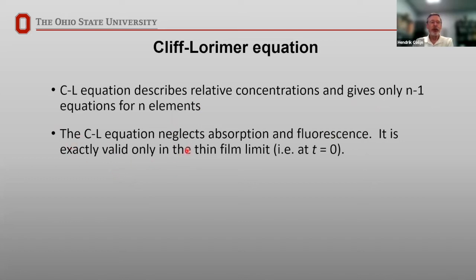So you always have 100% of the material. But this equation completely neglects any absorption and fluorescence. So it's exactly valid only in the thin film limit, of course, at a thickness of 0, where you don't have any sample. In reality, we will state that the thin film criterion is met if you have less than about 5% absorption. That's kind of our rule of thumb.